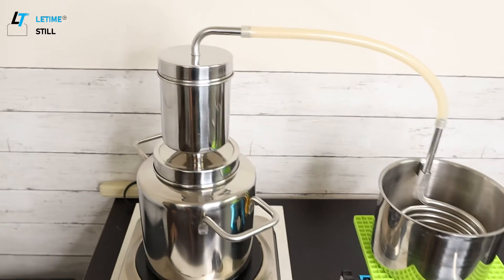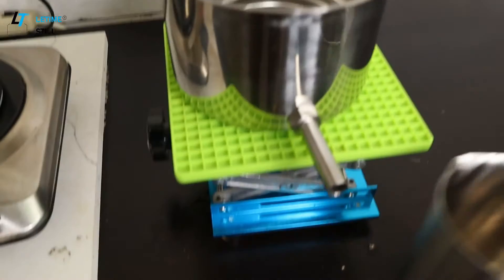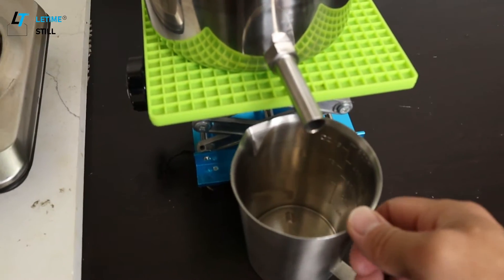We're going to use the leftover remaining in the pot. This is different from hydrosol making — hydrosol making works in the opposite way.